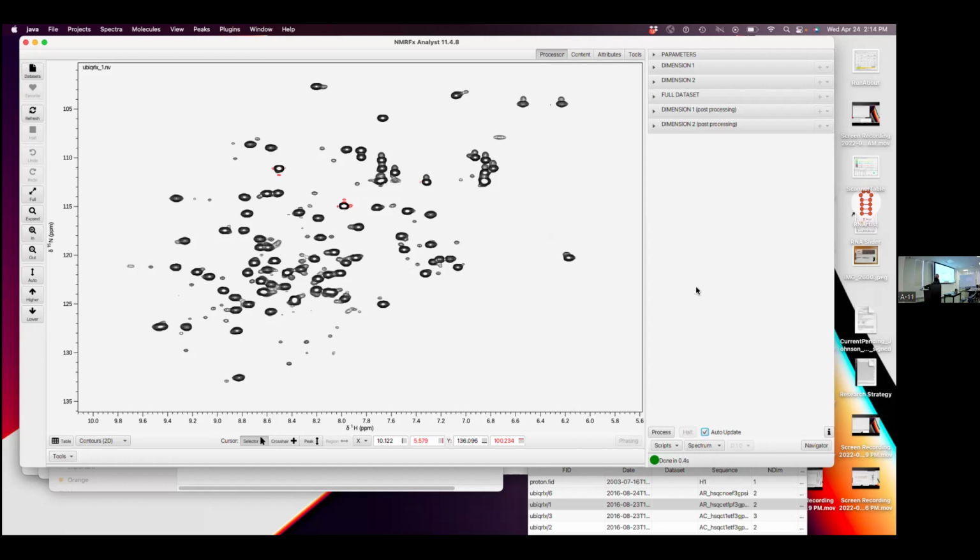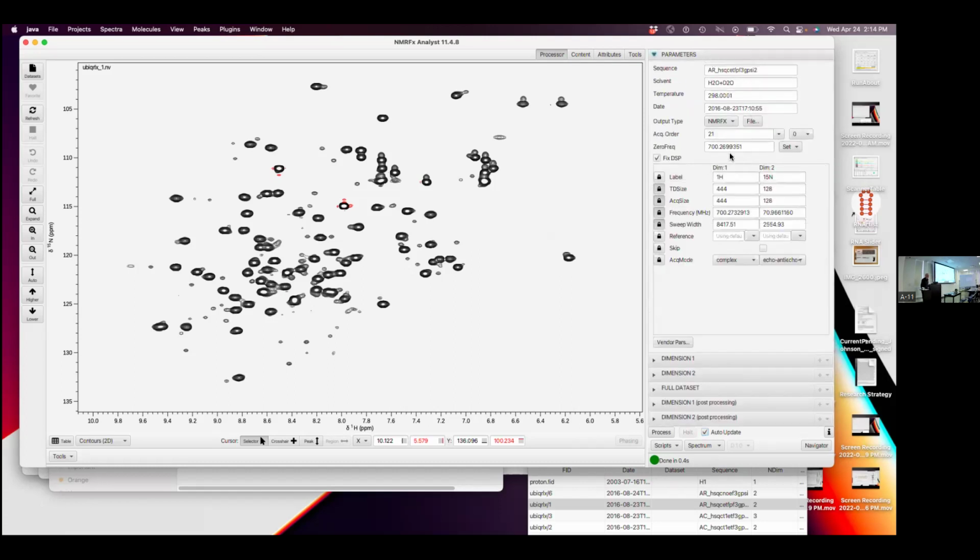We change the temperature setting from here. I don't see, those fields are not changing. And it's actually a request. One example is my referencing, which I haven't really talked about, depends upon knowing the solvent. And some group had some stuff that had DMSO in the sample, and that made me not think that the solvent was an aqueous sample. And that changed the way I did the referencing. They went into the ACQUS file and changed the parameter there, and then it detected this correctly, but I need to make these changes.